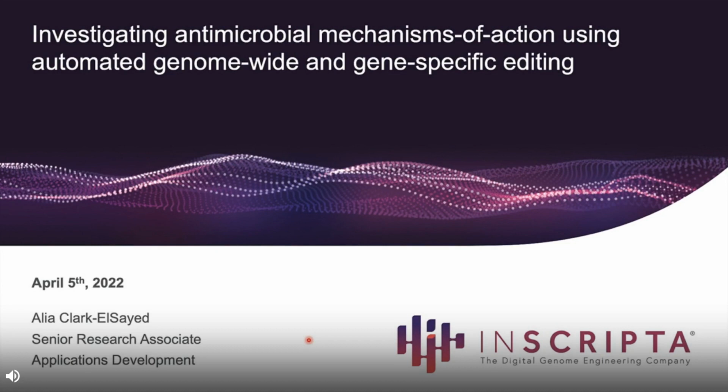Today for the webinar, I'm going to be talking about how we used the Onyx genome engineering platform to study the mechanism of action of two different small molecules. To do this, we built genome-wide as well as gene-specific libraries. We then used these libraries in selection experiments with the addition of the small molecules. And then after the selection experiments, we analyzed the distribution of the different edits within the library, and this allowed us to make hypotheses about how we think these small molecules are acting on the cell.